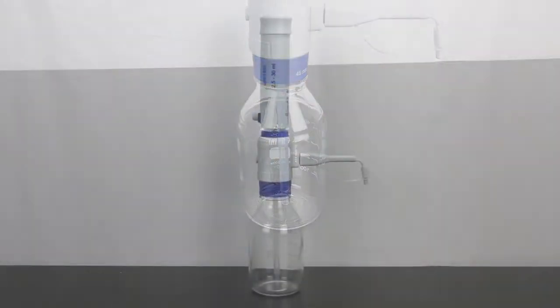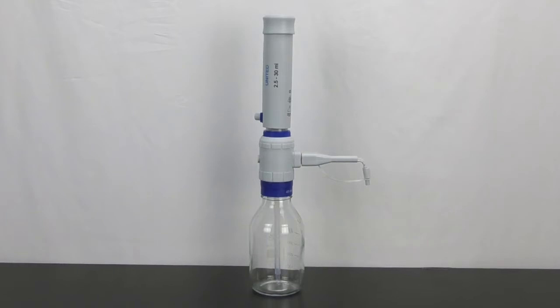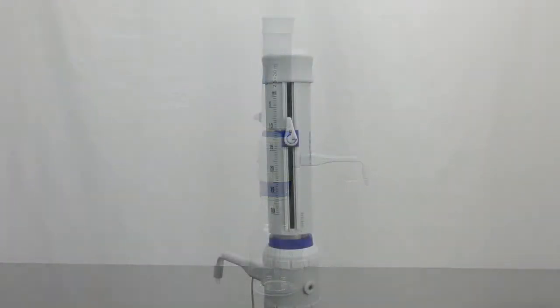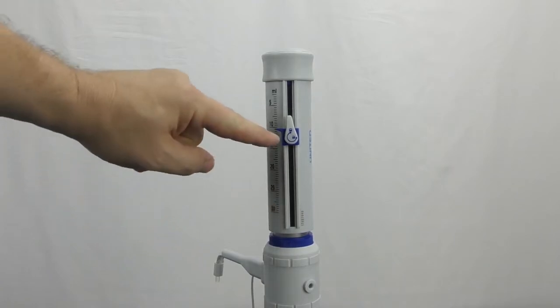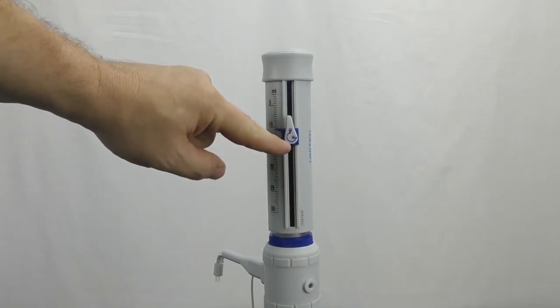The bottle dispenser is all set up. Let's go and look at the different controls. The range of the bottle dispenser is indicated along the side as well as a simple knob that indicates lock or unlock.